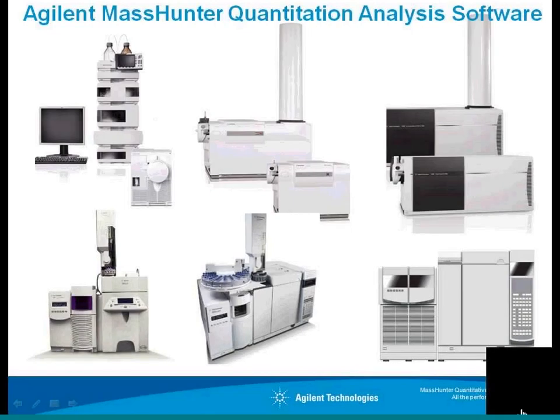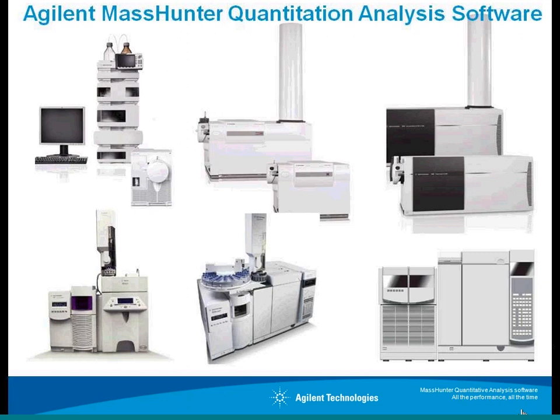I would like to discuss an interesting feature here, which is the metrics plot. Now, the metrics plot allows you to visualize across samples in a batch such things as ISTD responses to make sure that they're behaving appropriately, or let's say the variation in retention time across all the samples in a batch. If you want to monitor that, we've added and integrated into the application a graphical presentation of that. We call that the metrics plot.